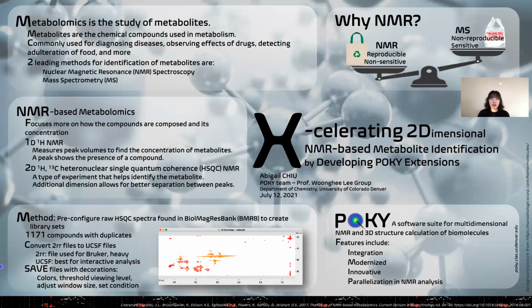Poky is the software program that I used for this project. It was created by Dr. Woong Hee Lee's group. It is a modernized version of another software called NMR-FAM Sparky. Poky is a software suite for multi-dimensional NMR and 3D structure calculation of biomolecules. For a future project, I plan to incorporate the library sets I made into an algorithm that automatically suggests compounds for the identity of the unknown sample and then overlay those suggested ones onto the unknown 2D HSQC spectra for confirmation. I hope you have learned something new through my presentation.